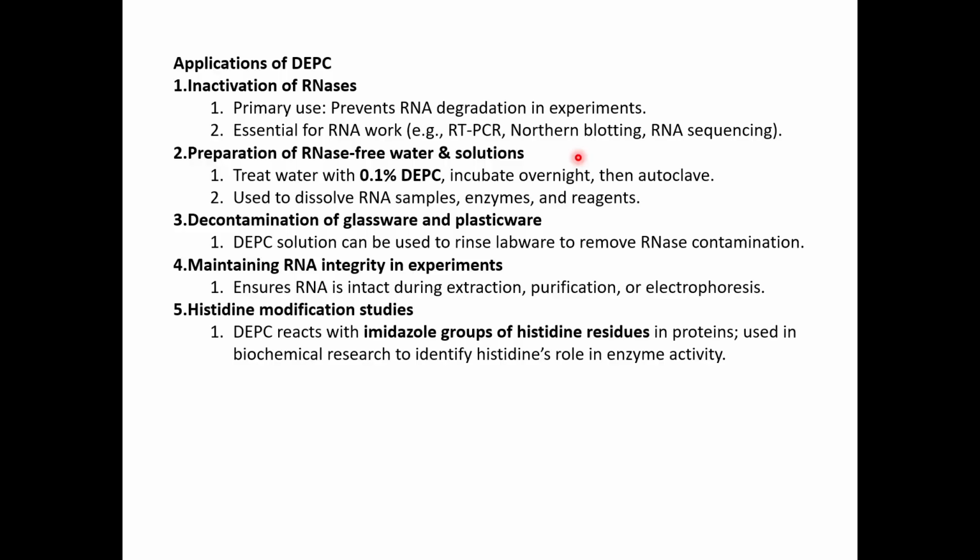So this has many applications. Inactivation of RNases: the primary use is that it prevents RNA degradation in experiments, and it is essential for RNA related experiments like RT-PCR, northern blotting, or when you have to send your RNA for sequencing, etc. So this is very crucial.